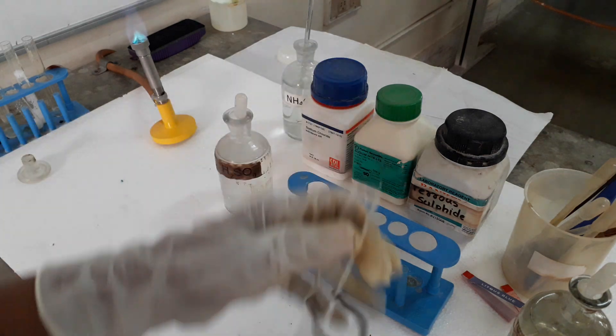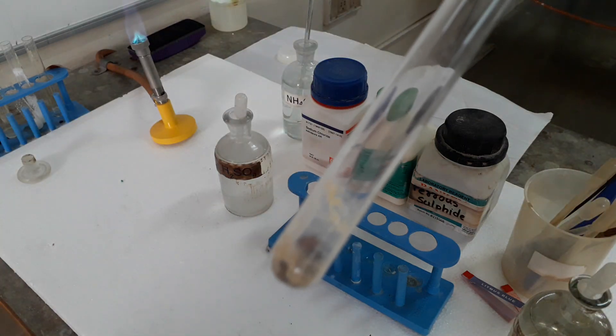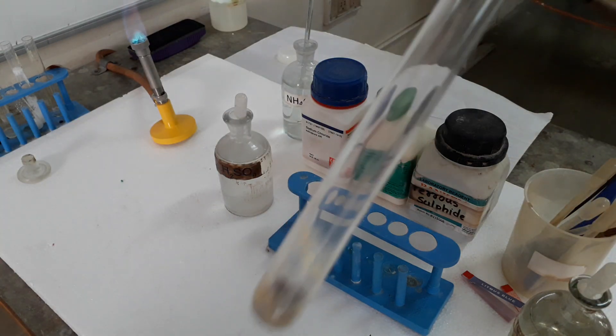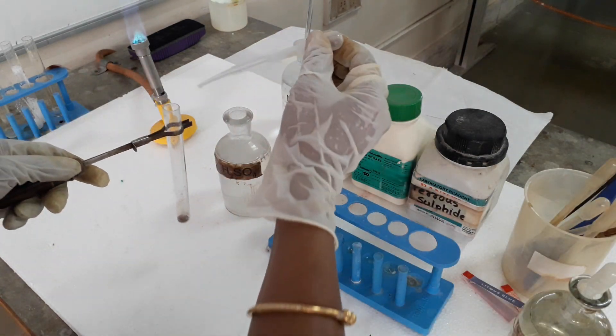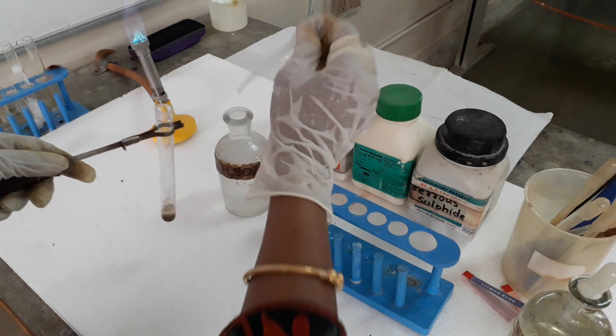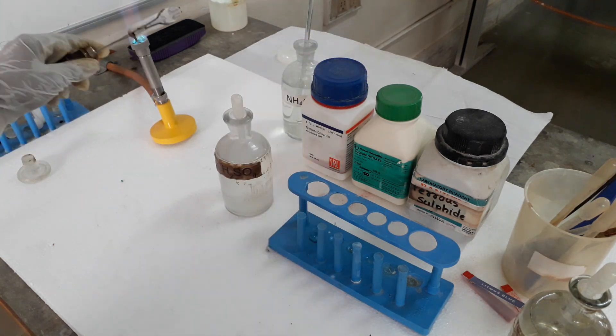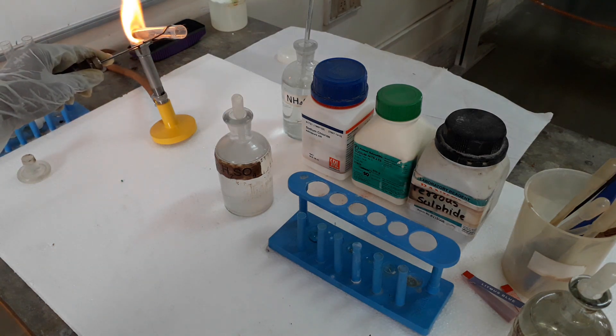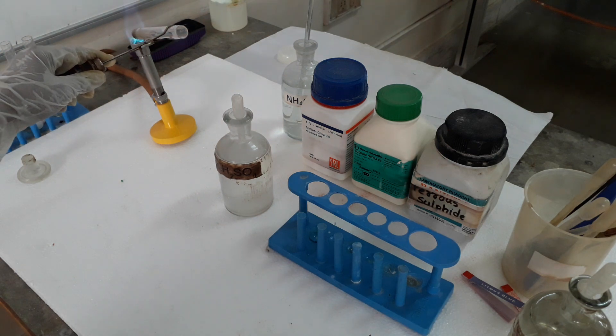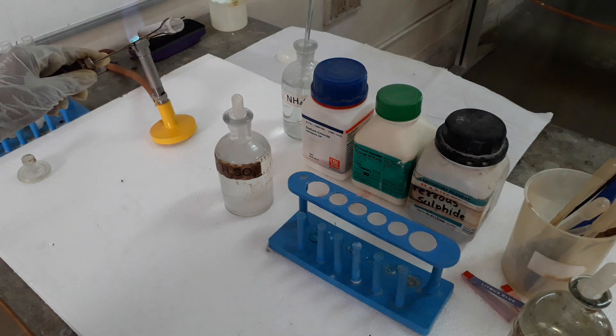Now the next one is sulfide detection of S2 minus. For that I have taken ferrous sulfide pieces. We will add concentrated sulfuric acid and heat it. Little heating is required, and we will see a gas liberates which has a rotten egg smell.